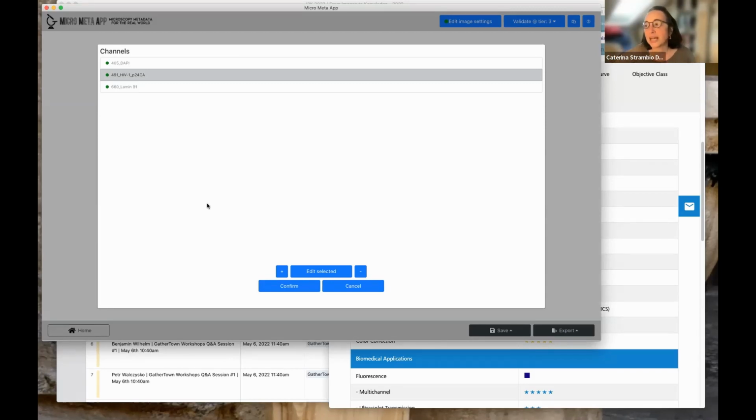For example, with the camera manufacturers, as I said, we are working on revising the model so that when you buy a camera, you will be given a JSON file. If you want to still build a graphical configuration like this, maybe it's useful for your users, you will be able to drag a camera that is already pre-filled. You don't have to do anything. You don't have to enter any information. You'll just drag it in and place it, and it's going to be all ready to go.